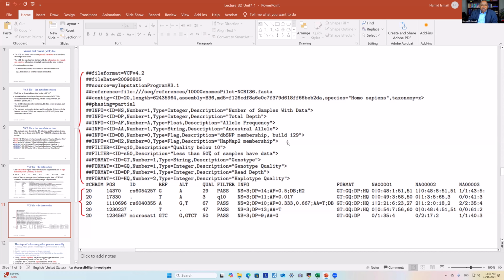Oh, I'm sorry, I think I went too far. Let me finish this. So for example, here the first allele is actually G, but instead of G it will be A. But the second allele is G, so there is no change in the second allele. So in one allele we have this SNP relative to the reference, but in the second allele we don't. We call this genotype heterozygous.